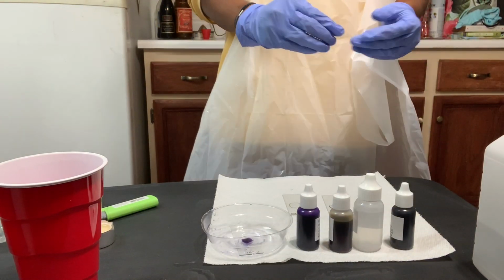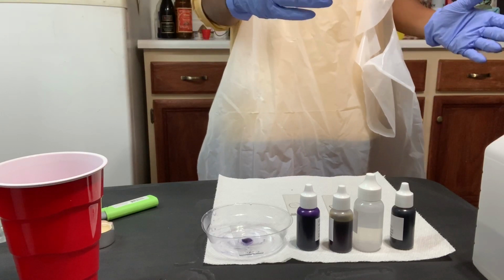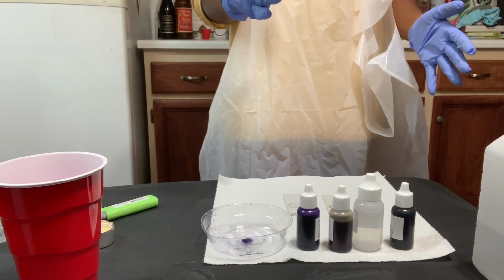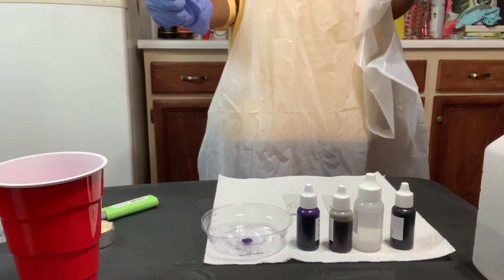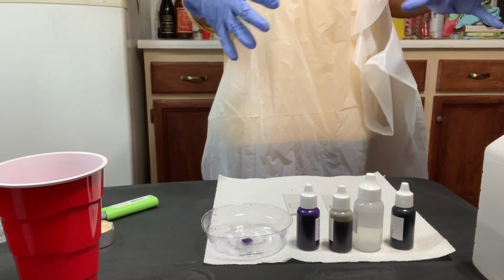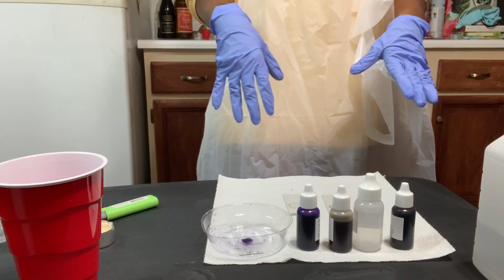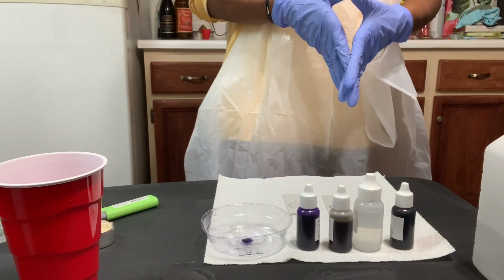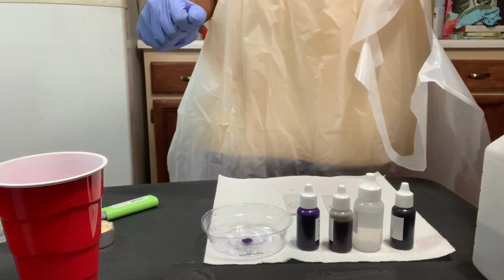Once that's done, I will let it completely dry and then view it in the microscope to see which power level I can best view the bacteria. I will do the same thing for S. epidermidis and S. cerevisiae, and that is it for this lab.